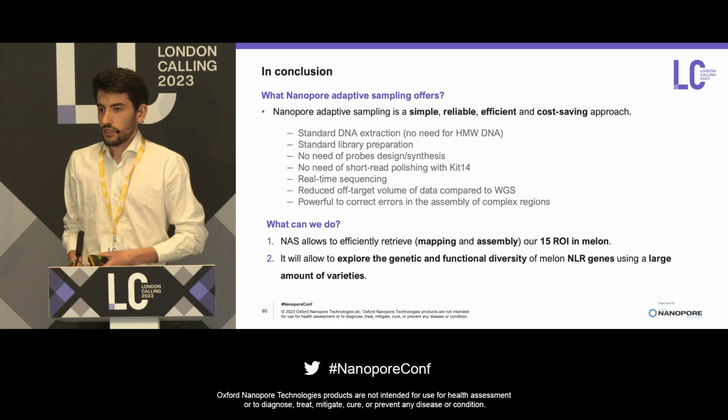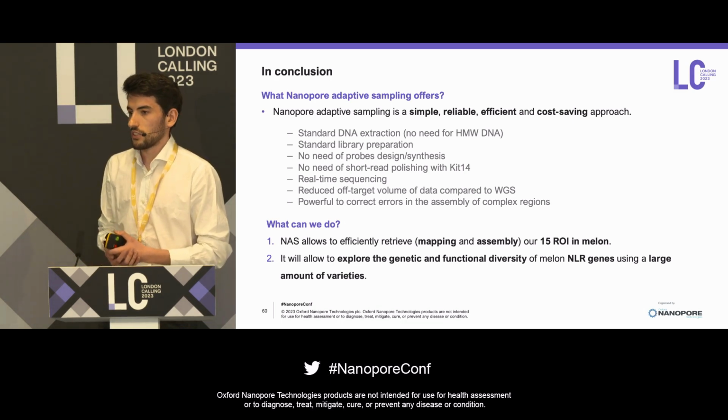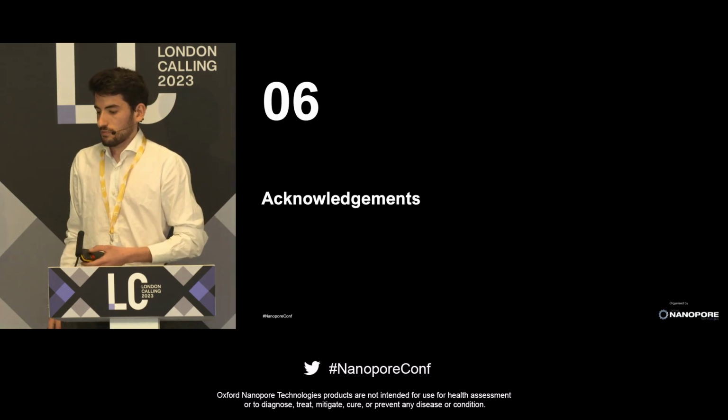So what we can do with this is that it allows us to explore the genetic and functional diversity of the NLRome in melon using a large number of varieties.